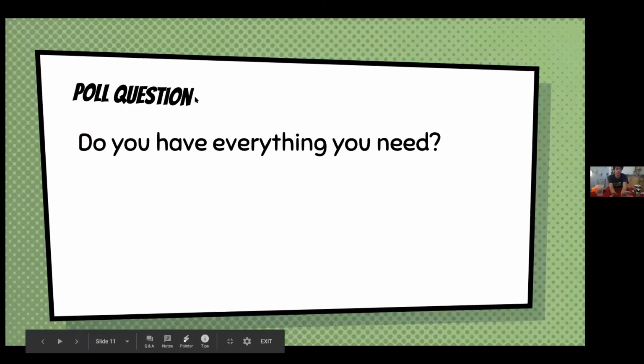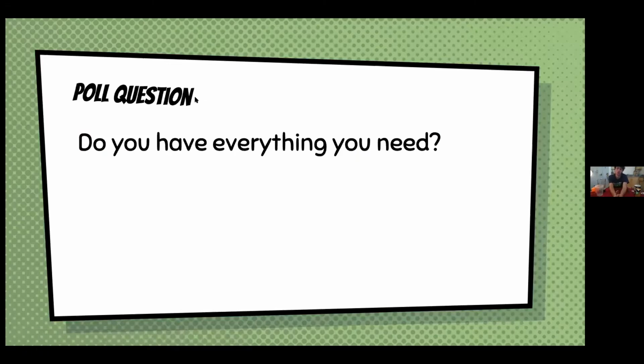This meeting is going to be recorded, so if you want to do it at a later time, you can always find the material, the recording, online. So I can see a lot of you are responding. Seems like a decent number is voting for yes. Most of you are probably not going to follow along today, but a good number of you seem to have everything ready to do it with us.